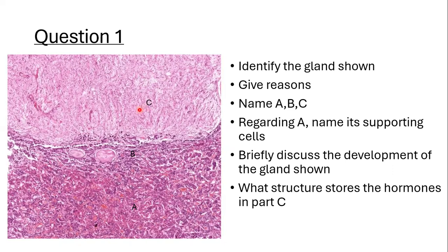So remember that infundibulum connects the posterior pituitary to the hypothalamus. So neurohypophysis or pars nervosa here, also median eminence, okay, median eminence too. The pars nervosa here looks somehow fibrous. If you compare A and C, you would see that A is much more cellular, but C is fibrous. Once you see these distinct characteristics that a part is mainly cellular and another part is fibrous, I urge you to think about pituitary.